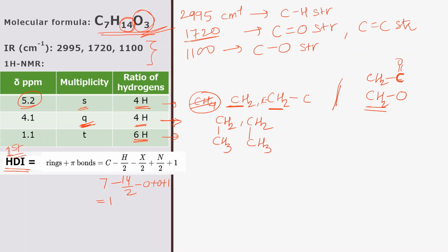So these are the 6 hydrogens which are also chemically equivalent, and I can see the corresponding data in the NMR data which is provided, and these are giving triplets. See, whenever you have this combination, quartet and triplet, it means this combination of CH2 to CH3 is present. So that is just a hint. So now let us try to assemble all these groups together.